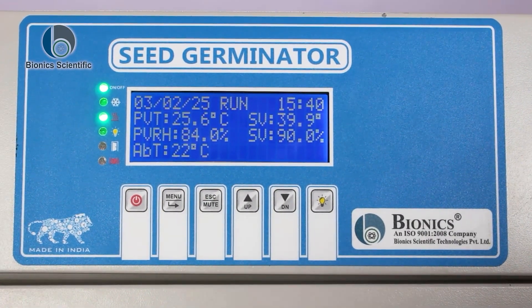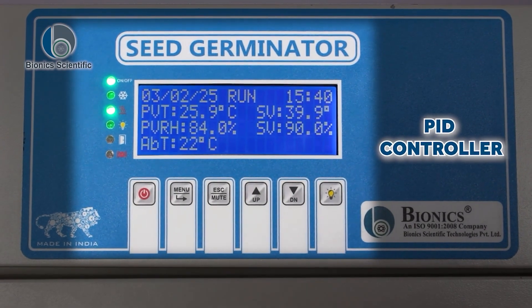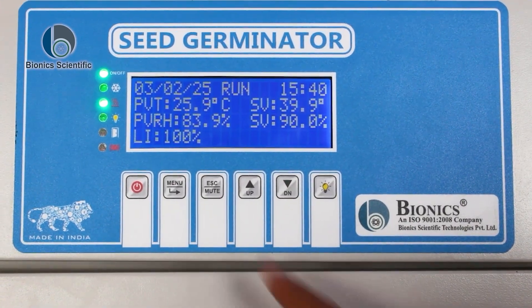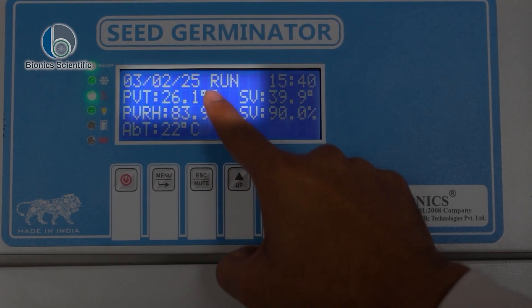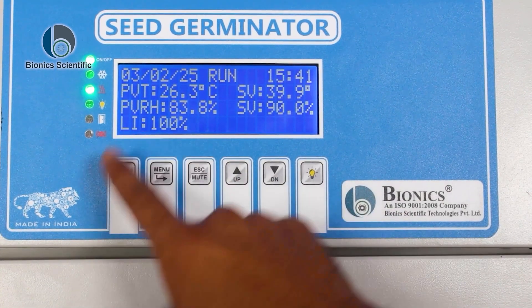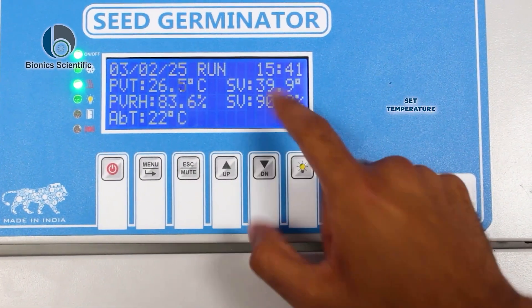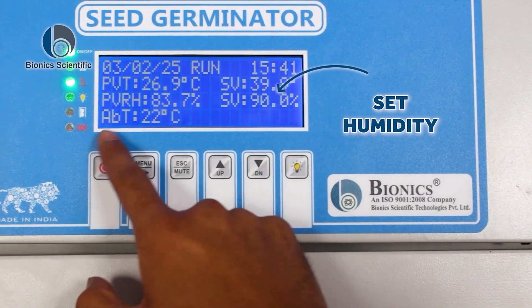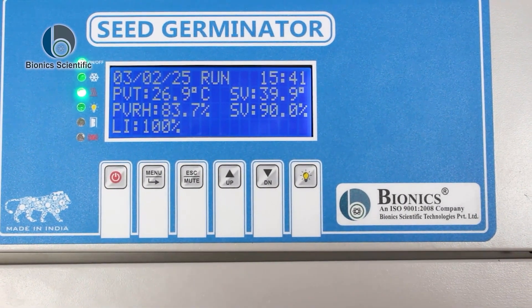As you can see on this control panel — you can also call it a PID controller — there are various things present here. First, this is our present date: 03/02/25. The time is 3:41 precise. This is our present temperature, this is our set temperature, this is our present humidity, and this is our set humidity. ABT is the ambient temperature, which is equal to our room temperature.